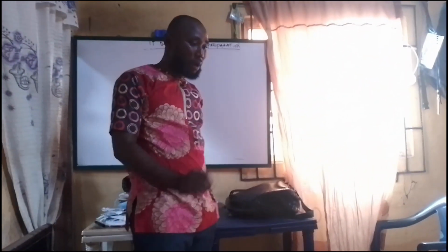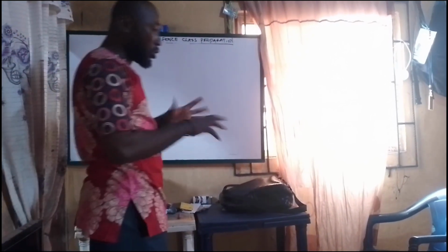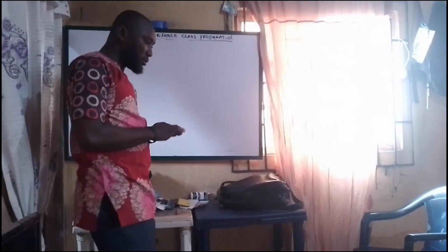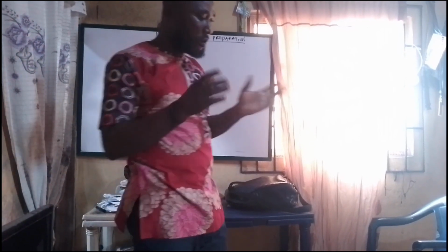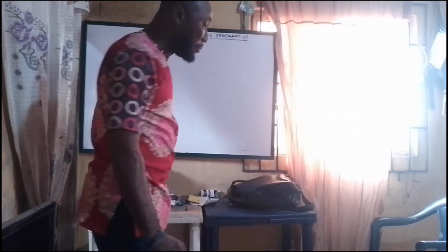Culture media are essential tools in microbiology, used to grow, maintain, and study microorganisms. Let me say it again: culture media are the essential tools used in microbiology to grow, maintain, and study microorganisms.